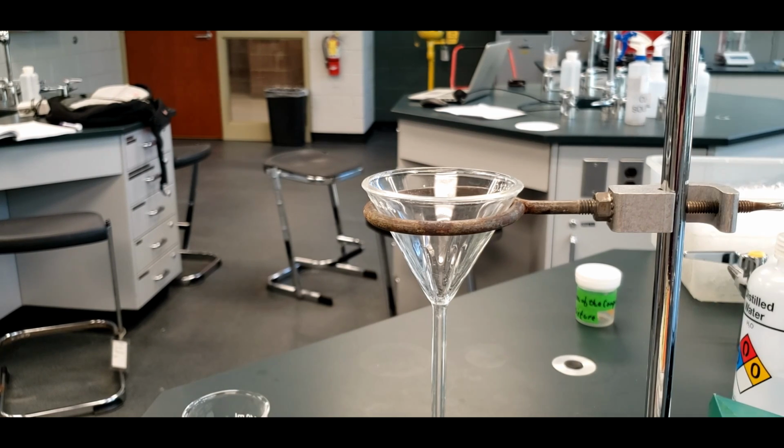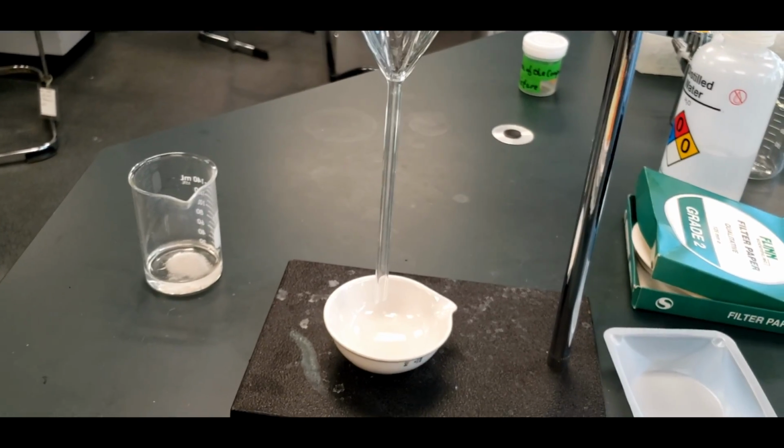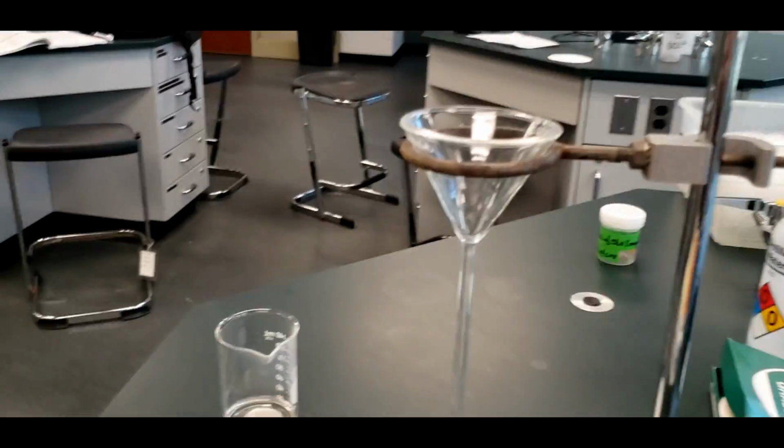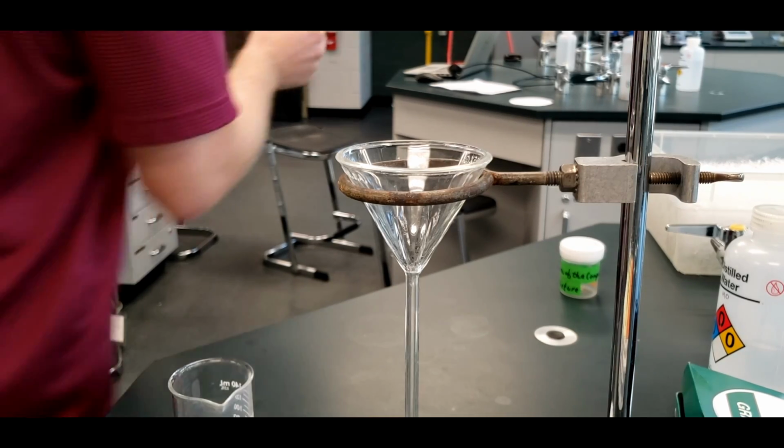Next, we're going to filter out the sand and just leave behind the saltwater solution in the evaporating dish below there. So that's a long stem funnel. And then I'm going to put in a piece of filter paper, the one that we just weighed, wherever it is.